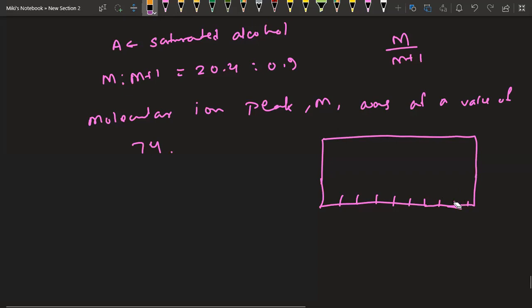So as I was mentioning, if I draw this clearly, because there were some other values here as well. Let's say this is 0, this is 2, this is 4, then we have, let's say, 6 over here. We won't need more than that because all the values are within this range. For 0, we have a doublet here. And in between these 2 and some other region, we have multiple values.